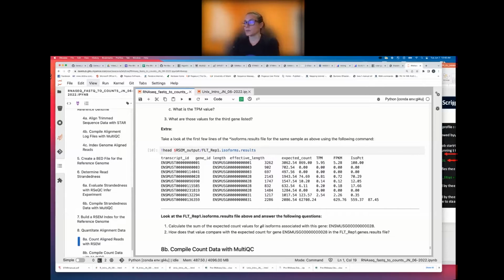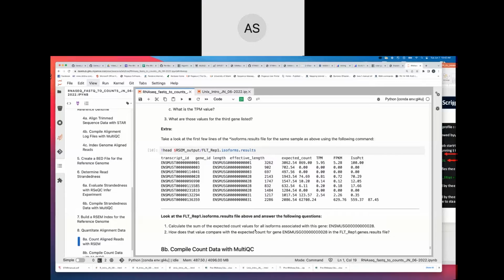So go ahead and put your calculations. You could just put the sum, or you could put what the calculation would be. I'll take either of them into the link that Armin sent. Awesome.